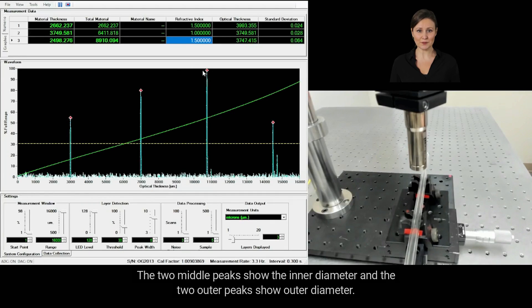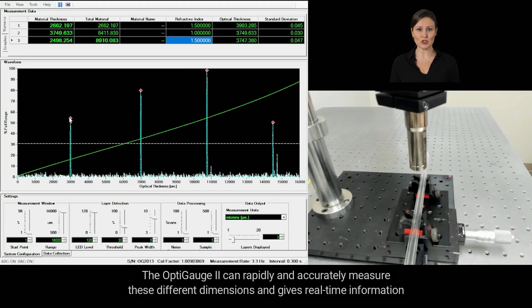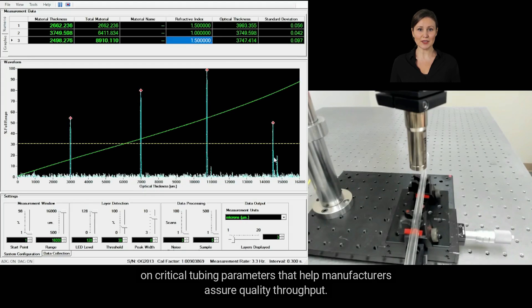The two middle peaks are the inner diameter, and the two outer peaks show outer diameter. The OptiGage 2 can rapidly and accurately measure these different dimensions and gives real-time information on critical tubing parameters that help manufacturers assure quality throughput.